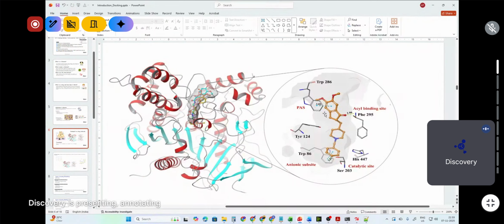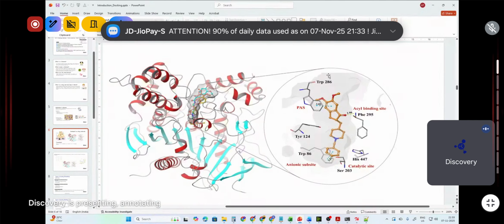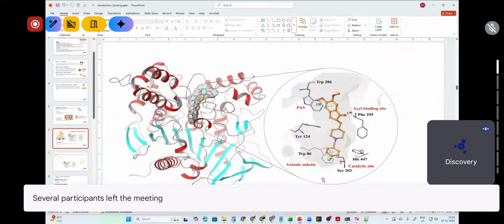Don't get confused, I'm just telling you why we are going to calculate the center of this drug molecule, so that we can get the central point somewhere here. Once the grid box center is placed here, I will be able to select how big the grid box should be, to enclose the whole active site pocket.